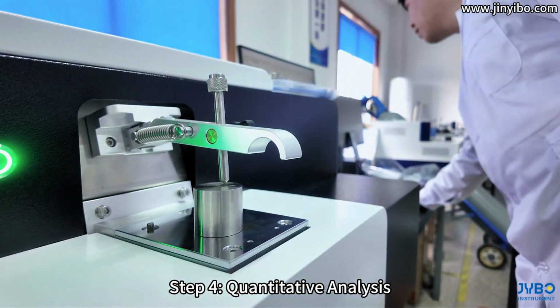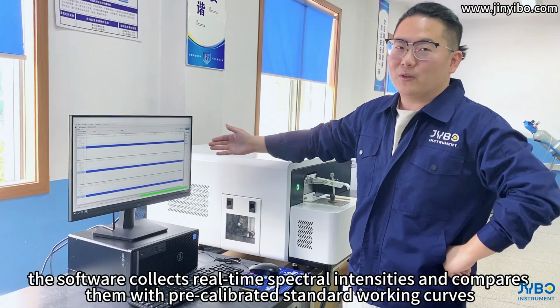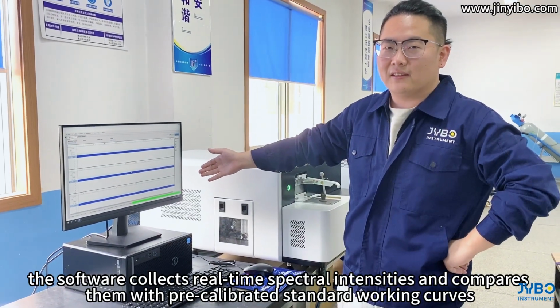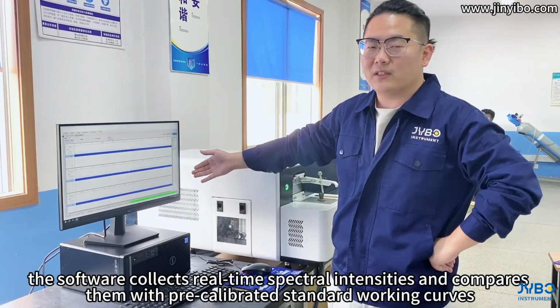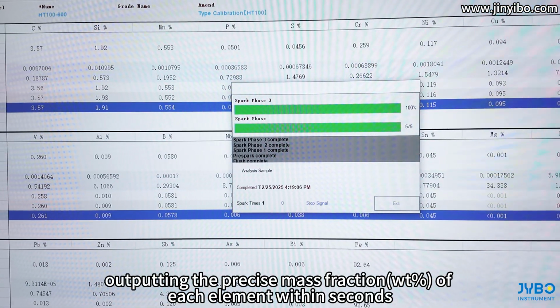Step 4. Quantitative analysis. Based on fundamental spectroscopic quantitative principles, the software collects real-time spectral intensities and compares them with pre-calibrated standard working curves, outputting the precise mass fraction of each element within seconds.